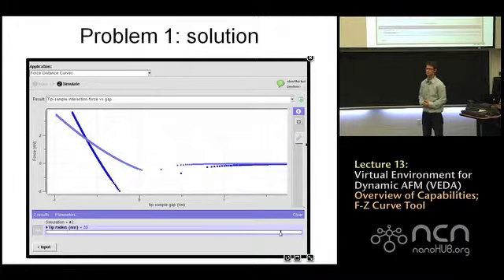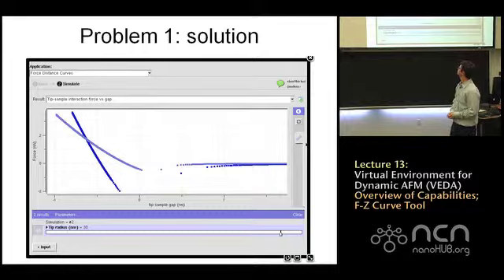Okay? Any questions on problem 1? Are you looking at force versus gap or force versus deflection versus z distance? Minor offset.